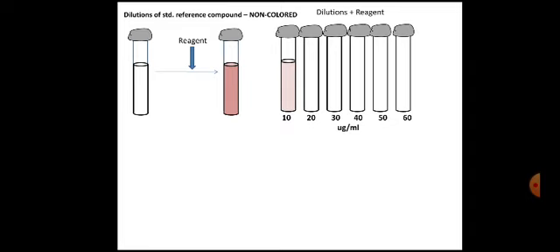If it is a low concentration, then after addition of that reagent, it is going to produce a faded color, and then the intensity of that color will further increase, that is formation of dark color, we can see here. So this is how you can convert non-colored compounds to colored compounds.